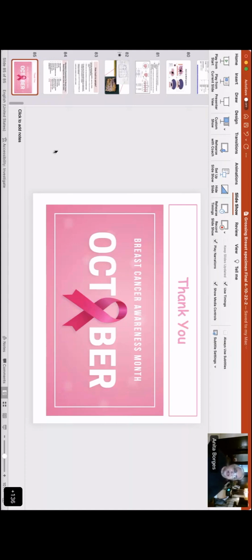Then you don't have anything to do with cotton and all that, and you get the most beautiful fixation that you can possibly get, with no red areas, because the fat often does not allow the fixative to get in. Ultimately, you're going to take the sections anyway. You're going to measure the tumor, which you can anyway do when it is fresh. Why do you need to keep it to measure it after? In any case, you're not going to be able to measure the DCIS because you can't feel it. So why don't you do that?